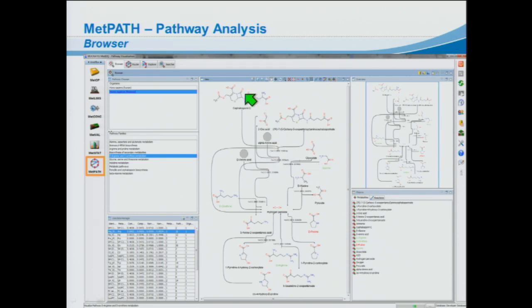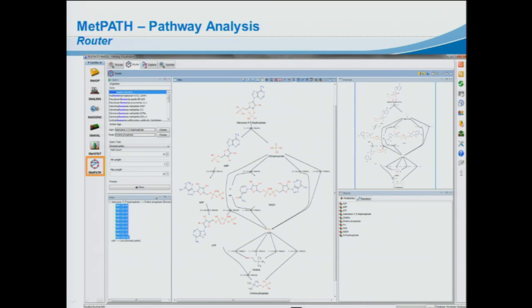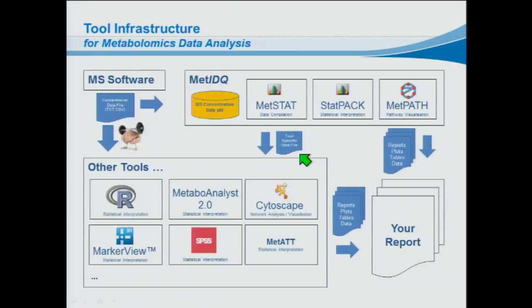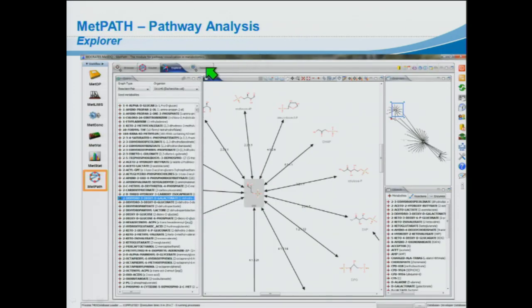The next is you can also pick out two metabolites and find all routes between these two metabolites. Or you can pick out a metabolite and get the complete neighborhood of the linked metabolites, which are linked via enzyme reaction to this one. And of course, we have a search feature which makes it possible to look up by name, and you can look up, for example, any molecule in the data set and display this pathway or whatever.